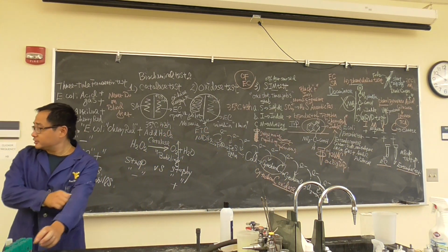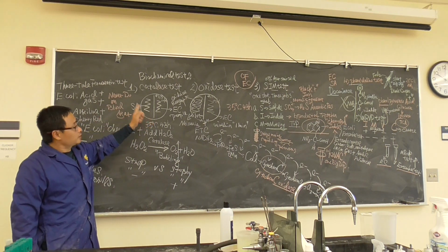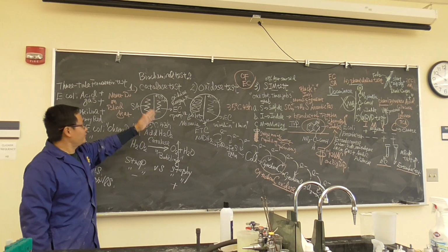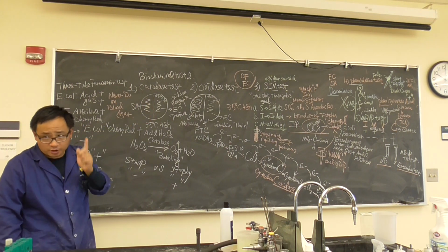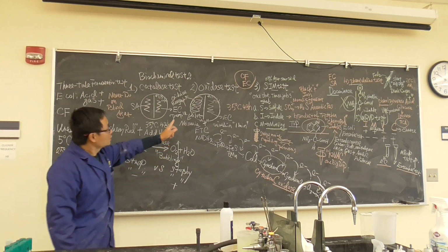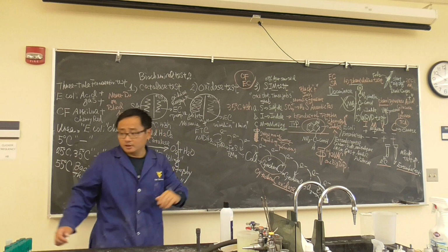So let's go over it. Everybody got a plate. Split it into 2. Left side Staphylococcus aureus, right side E. coli for the catalase test. It needs incubation, so the confirmation test will be next week Thursday. Oxidase test, left side Neisseria.